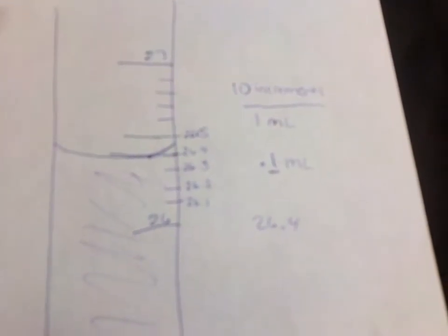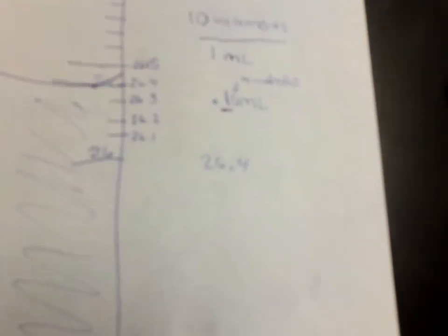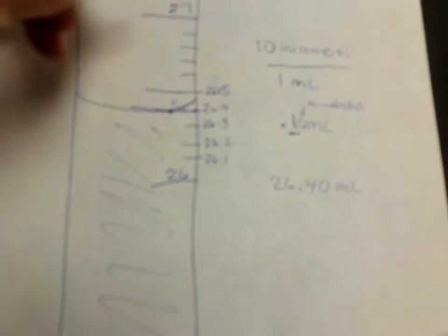So if I read to the, if my equipment reads to the tenths place, I need to guess to the hundredths place. So please make sure for all of your calculations, all of my burettes will read to the hundredths place. So because this is on the line for 26.4, I would put it as 26.40 ml.